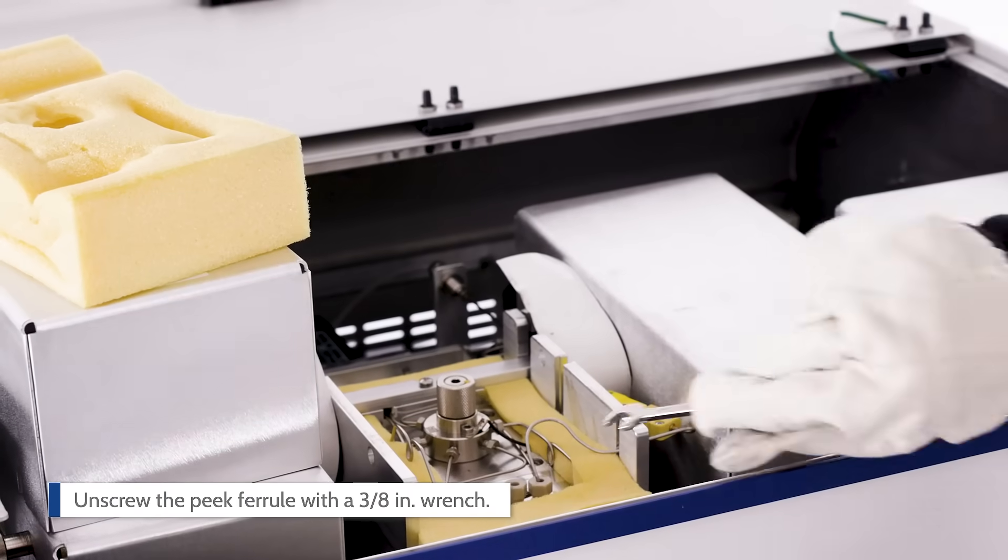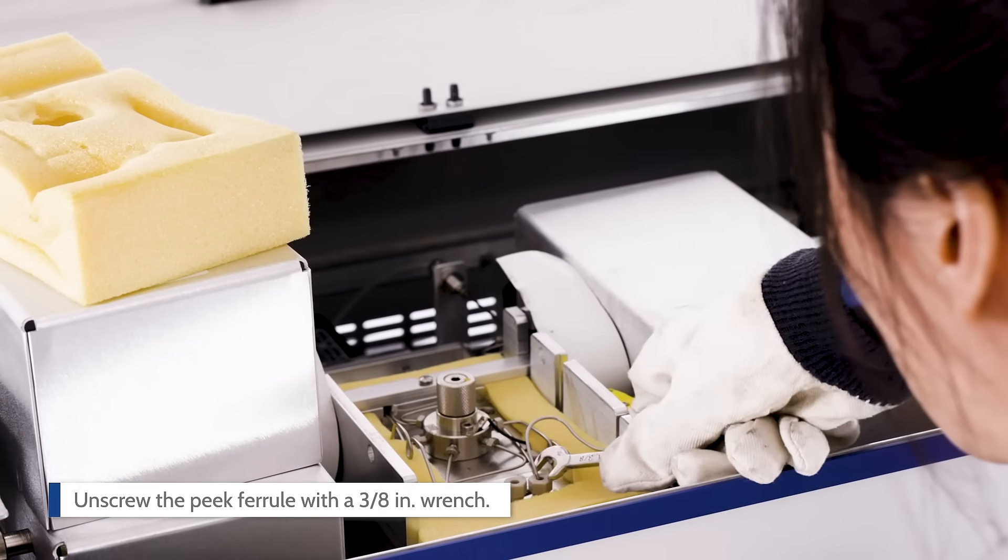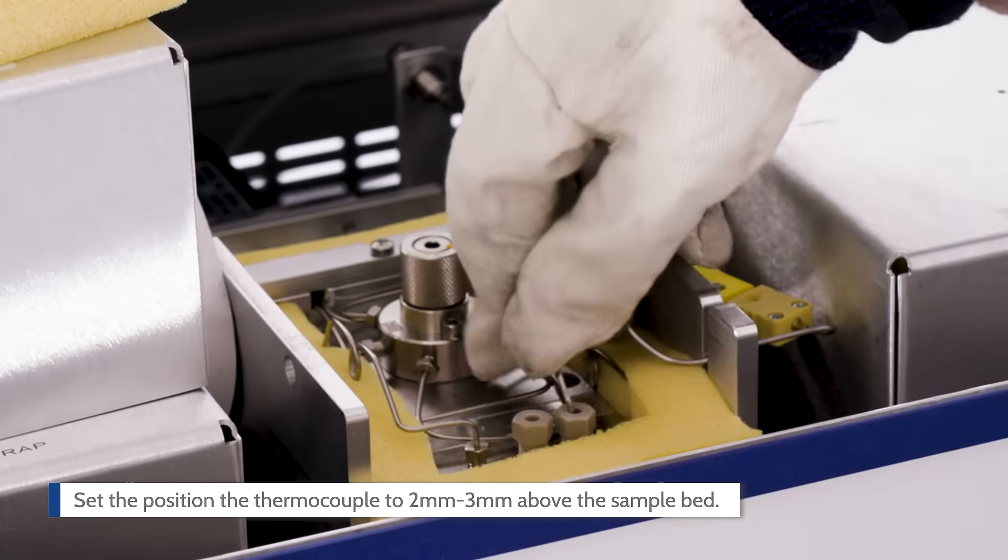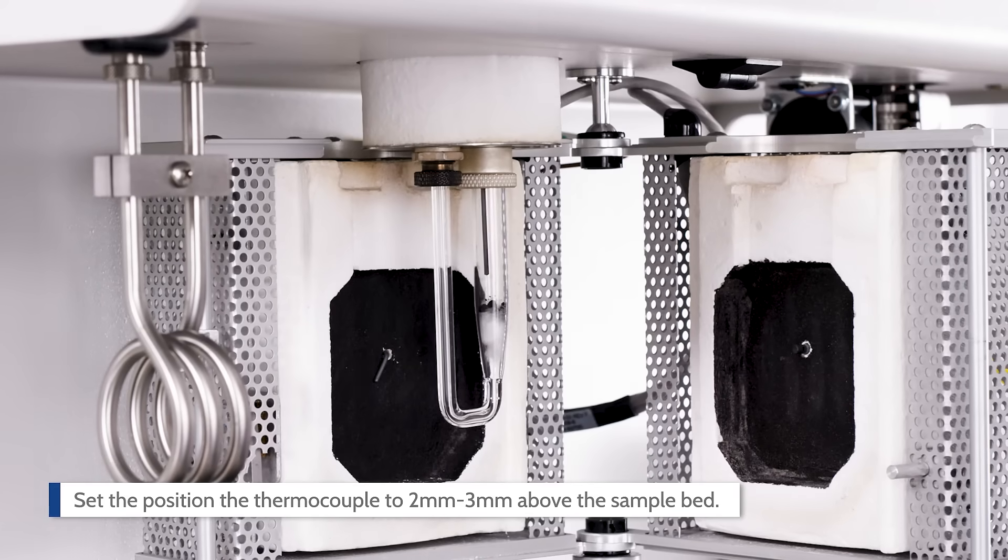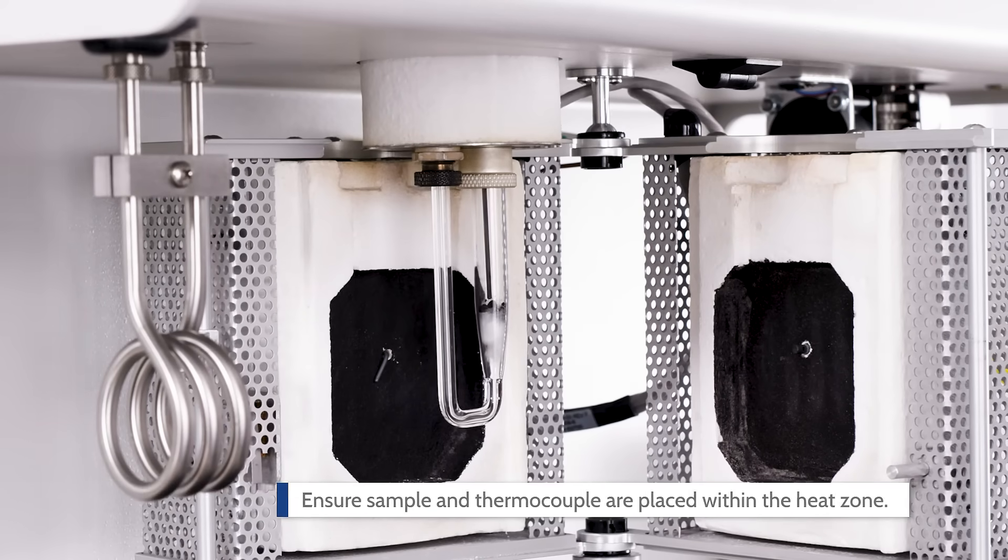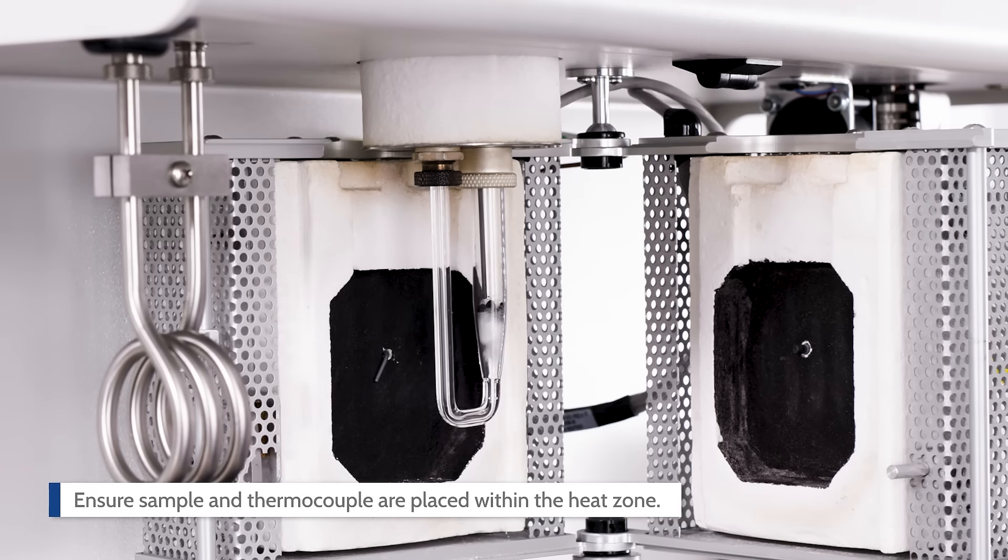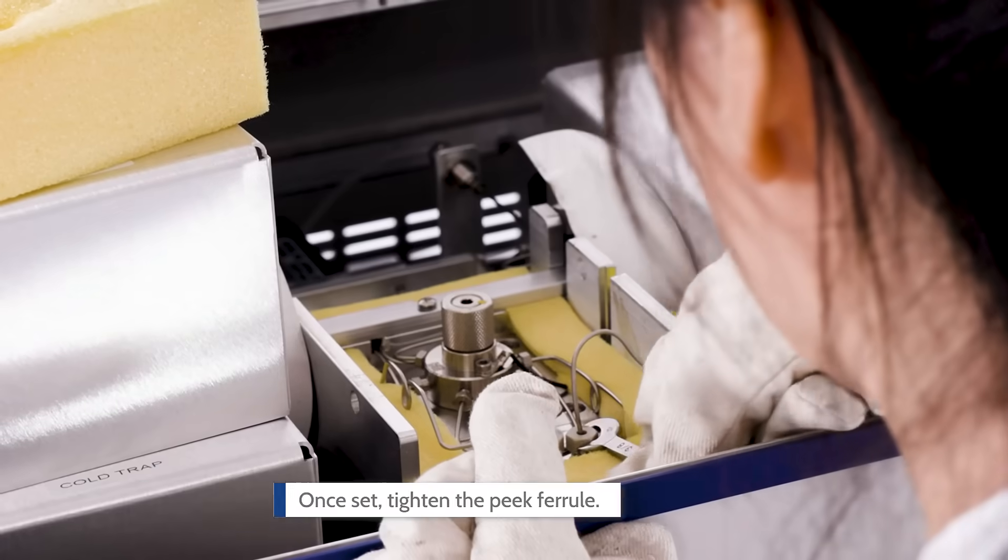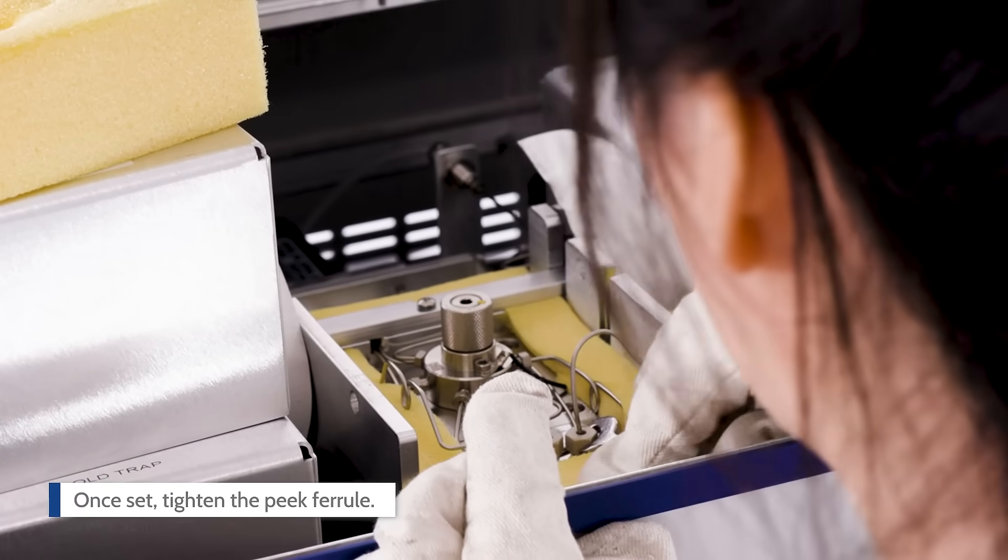Unscrew the PEEK ferrule located on the lower right with a 3/8 inch wrench. Set the position of the thermocouple to 2-3 millimeters above the sample bed. Ensure both the sample and the thermocouple are placed within the heated zone, which is the black area on the furnace. Once set, tighten the PEEK ferrule.